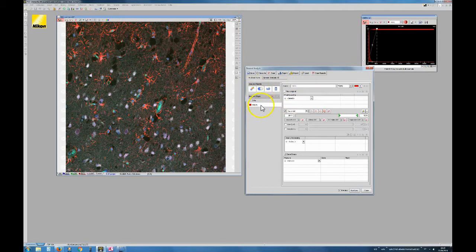Every time we create an analysis channel, we get this display here. Okay, so I could now select a 2nd channel if I want to analyze the blue, the nuclei. Then I select here, I get a 2nd one. See, it looks the same. Okay, so let's delete this one for now.